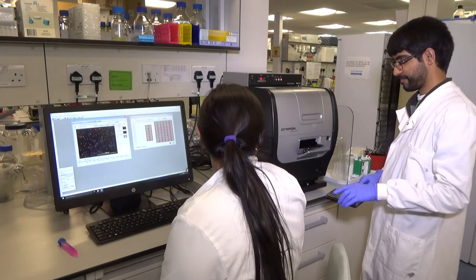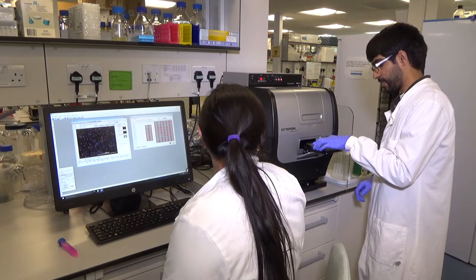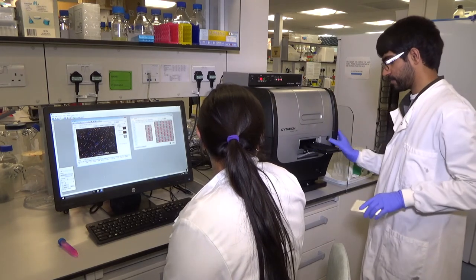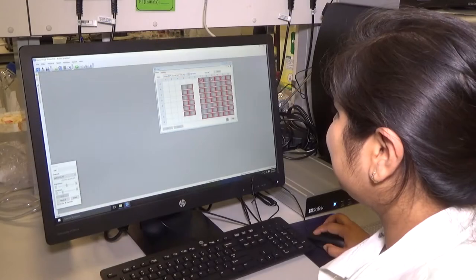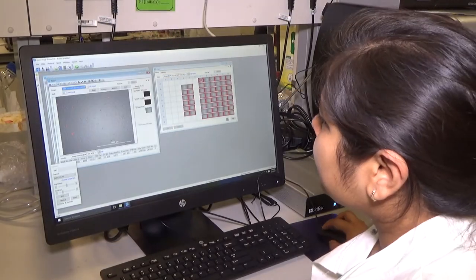And then we insert our plate into the Citation 3 for measurement. And then finally we analyze our results using the Citation 3 software.